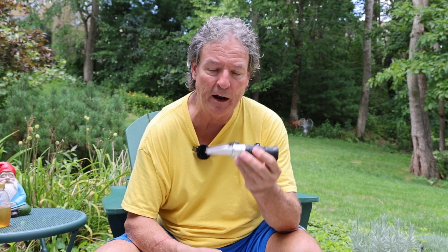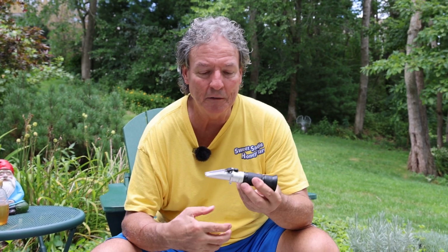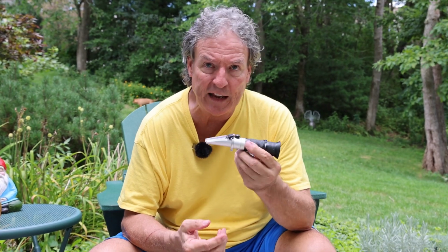Testing is pretty simple, but the first thing you need to do is, when you get your refractometer, and these are not expensive, I bought this on Amazon for $23.98 in 2019. And I just looked it up today and they're down to $22.98. So the prices are just falling off like crazy. They're not expensive, but it's a critical tool. When you get it, you're going to need to calibrate it.